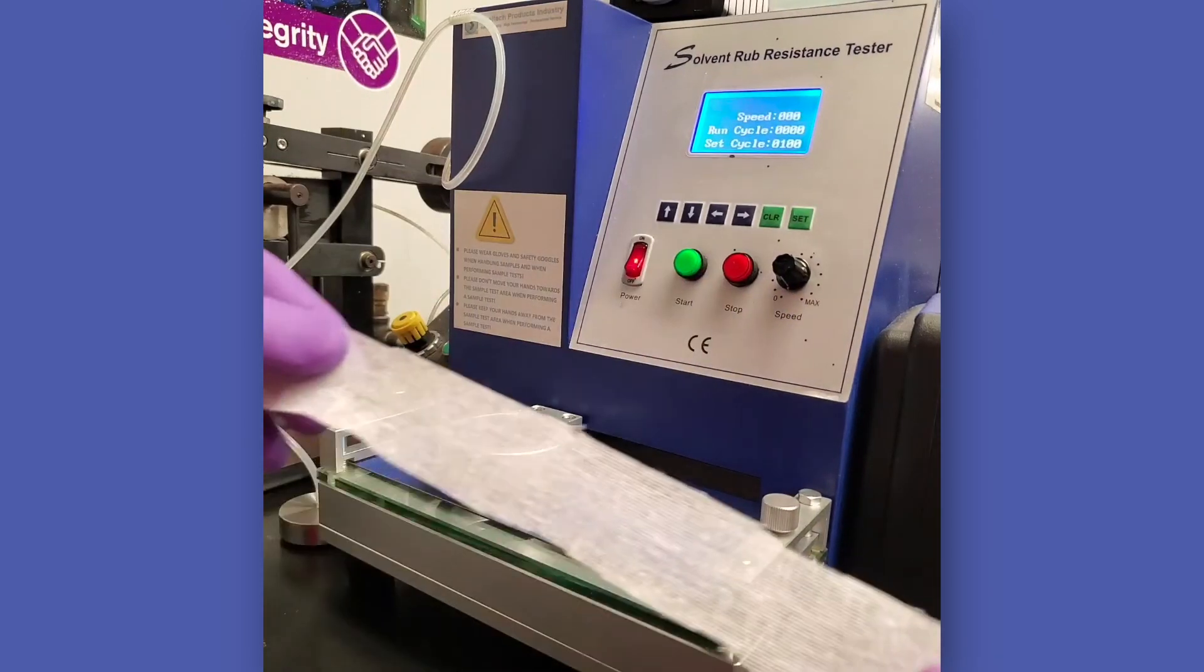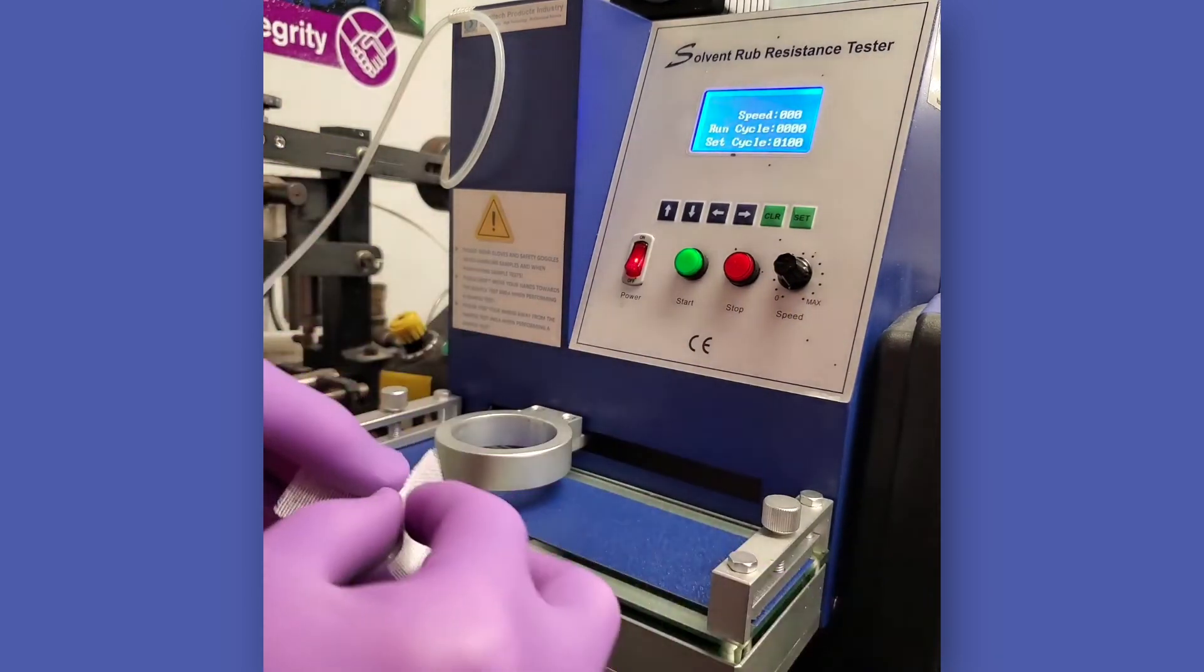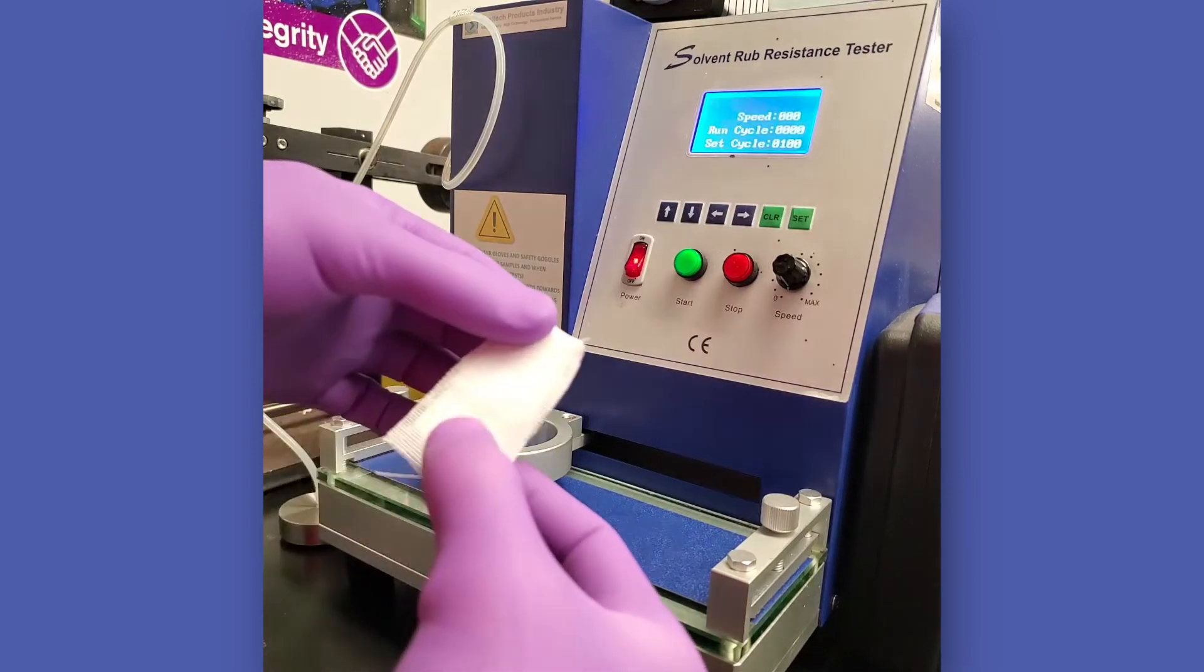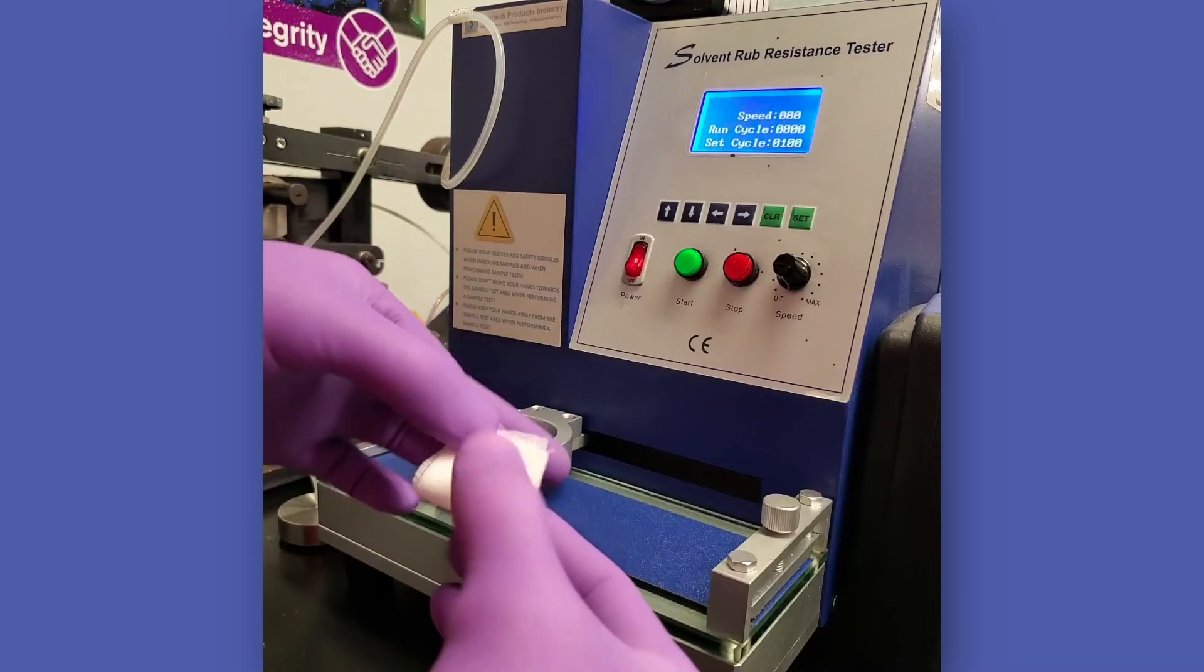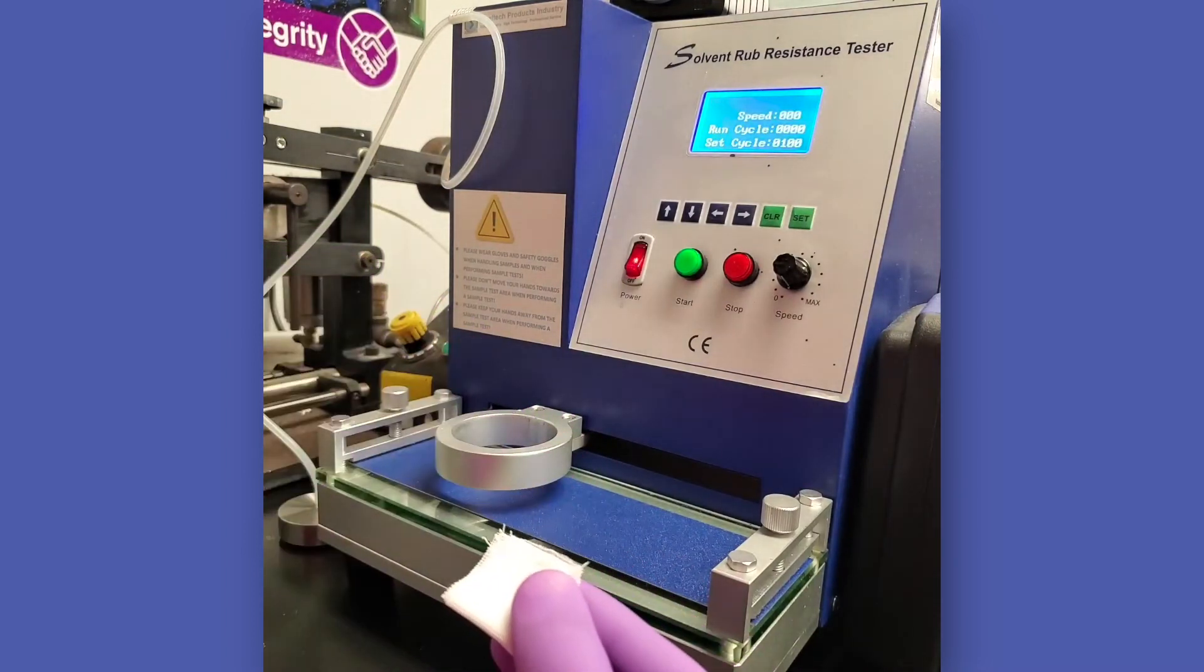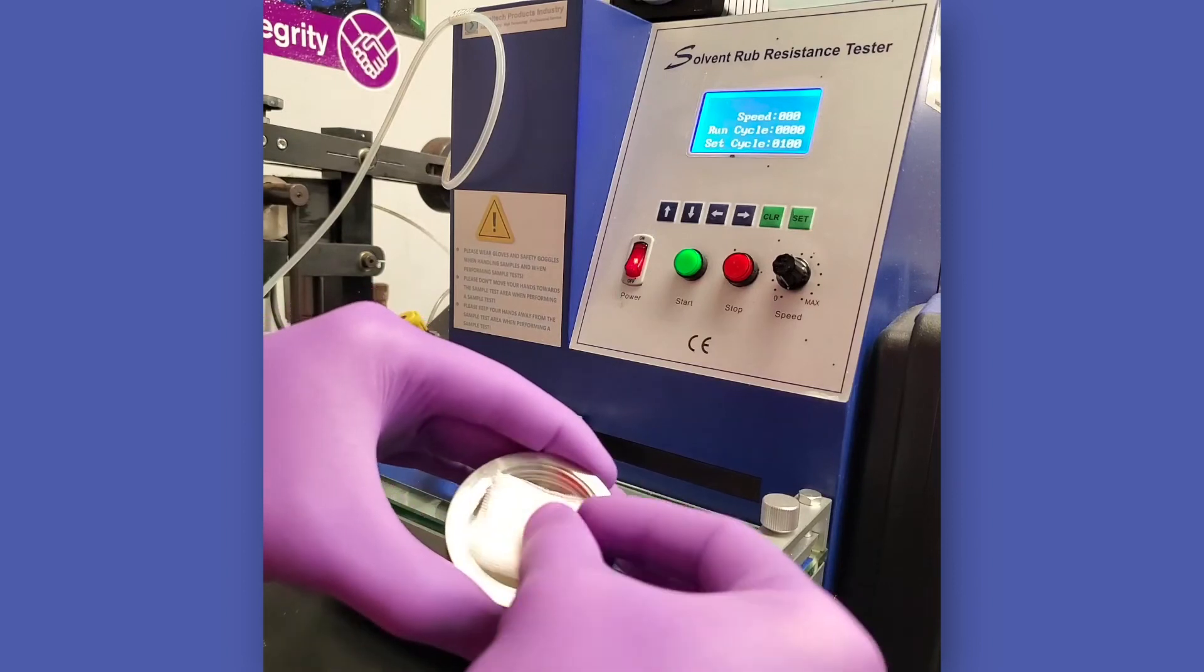Select the agreed upon solvent for the test and be sure that the solvent reservoir is filled as recommended by the rub machine equipment manufacturer and that the pump setting is correct. If not, too much or not enough solvent may be delivered to the testing pad, which may lead to false results.